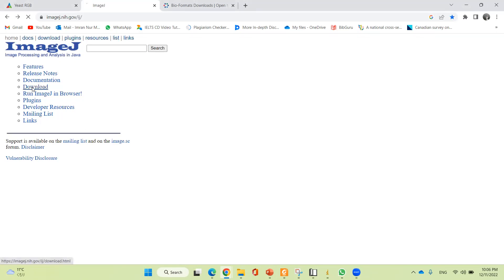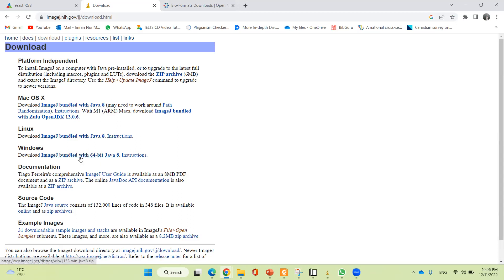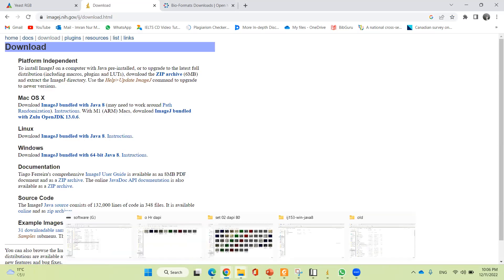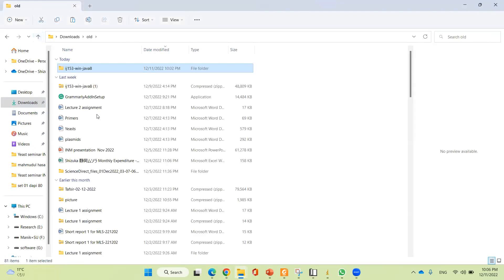If you click on download, it will show different types of operating systems. I'm using Windows, so I'm going to click on that one. After clicking, it will be downloaded. You can see that it is downloaded here — this is the ImageJ software.